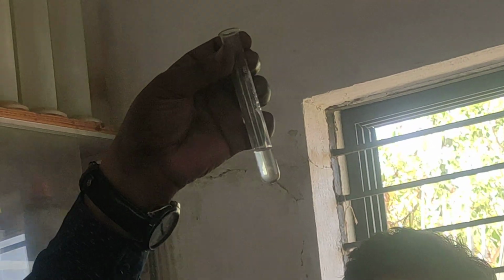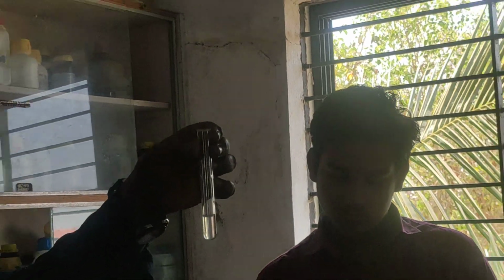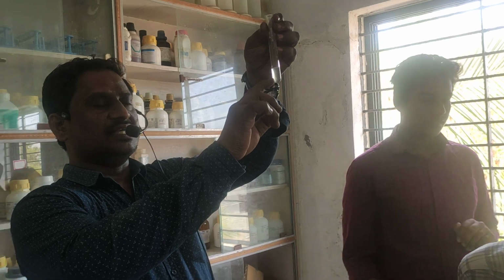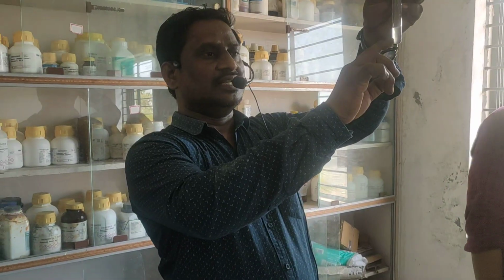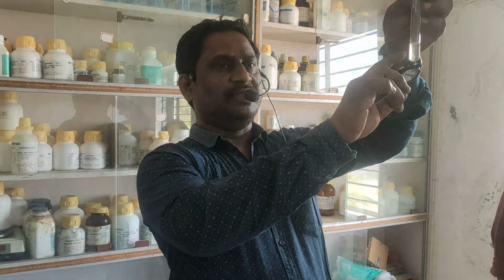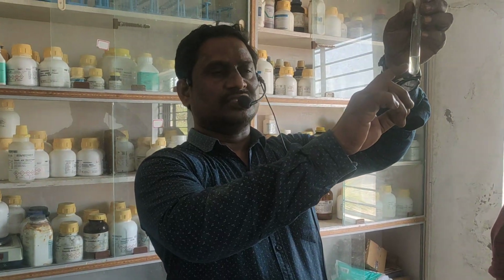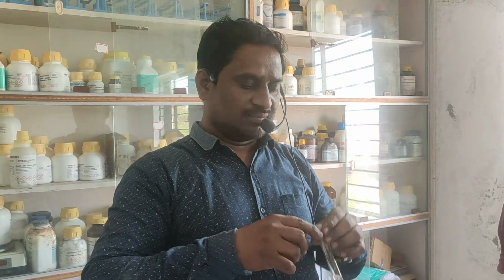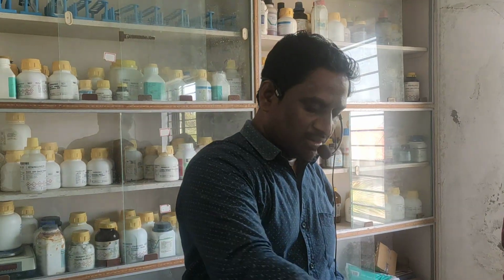So group 4 also is absent. All of you write: original solution plus NH4Cl plus NH4OH plus H2S water, no precipitate. Group 4 is absent.